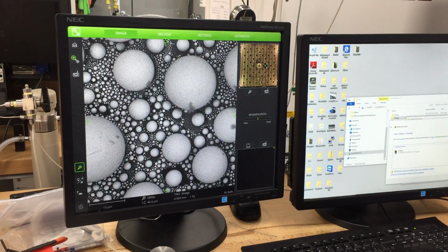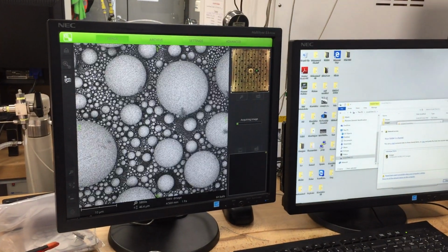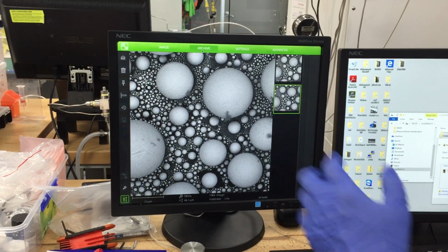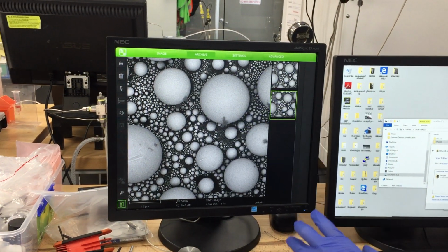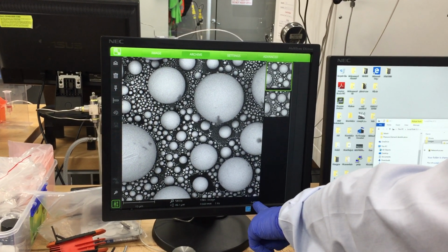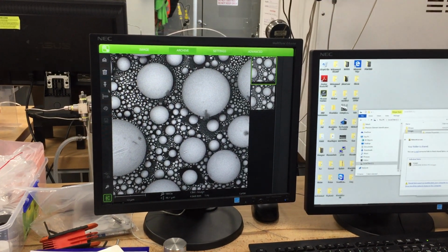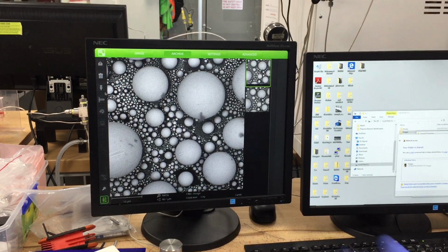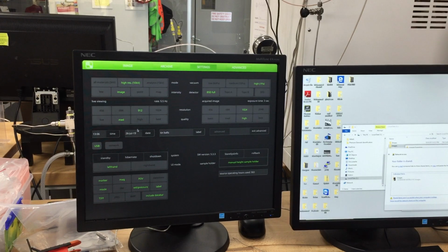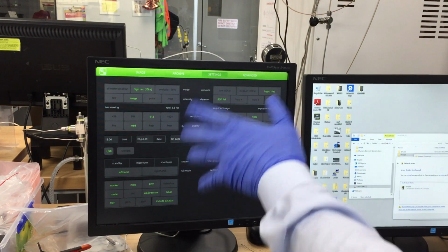So if I were to record it again, I record it by clicking on the camera icon. This time the tin balls is going to appear on the image. Remember that name will be stuck there permanently. You cannot change it. In the last image that we recorded, I only had curtain, so it will have curtain on it. I cannot change the name later now. It's too late. So remember to change the name before you record. Otherwise, whoever put the names before, it will come along with that. The date and time are not really important, because it should be set automatically.